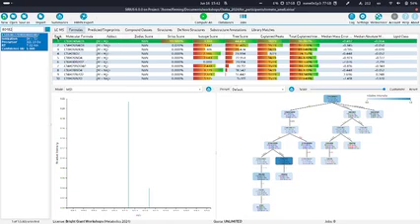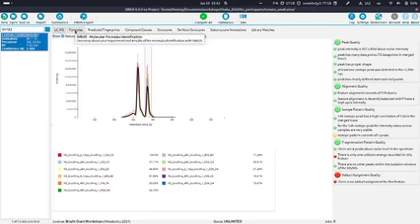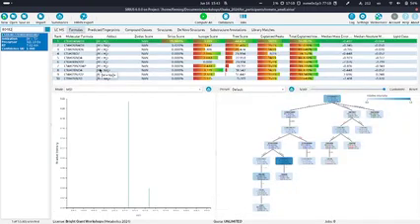So, of course, we still have the LCMS view, which I talked about already. You will now have the list of the top 10 molecular formula candidates here. The formulas themselves will be in this column. You will have the rank at the left. You will have the adduct. Zodiac, we did not run it on the pre-computed project space, so we always have a not a number score here for Zodiac.